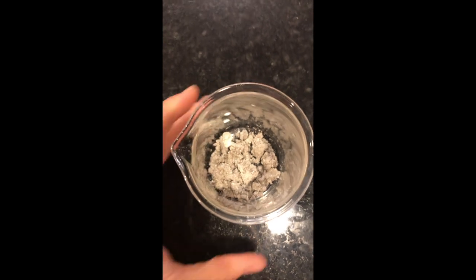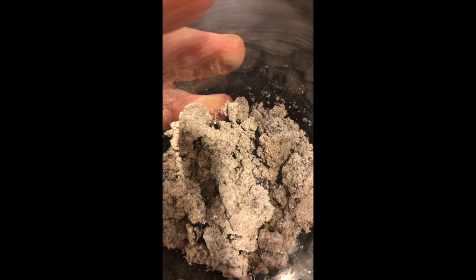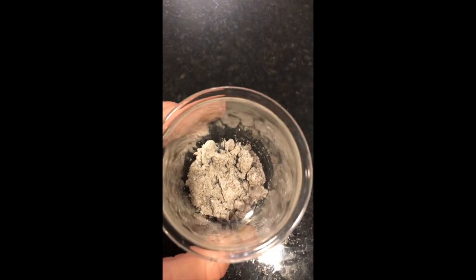All right, and here is our beautiful silver. Look at that. So awesome. So I took the final weight of it with the paper. Okay, so our final measurement of the paper with the crystals was 5.48 grams. What I did instead is I just weighed the blank filter paper before, and so if we just subtract the two, we can figure out how much silver we made.